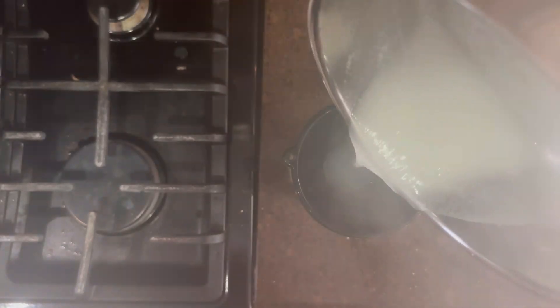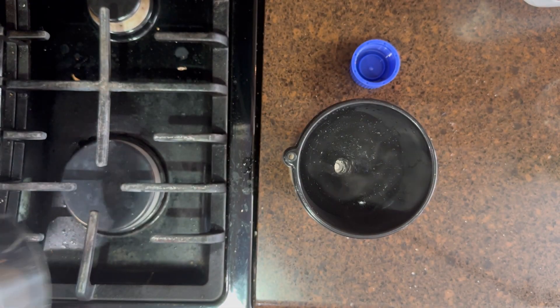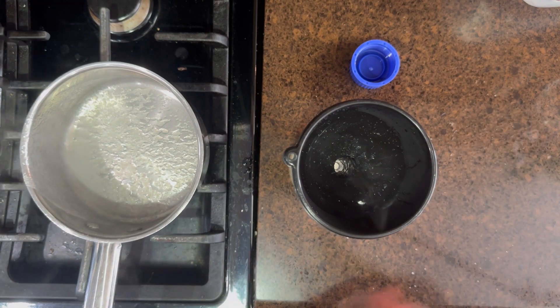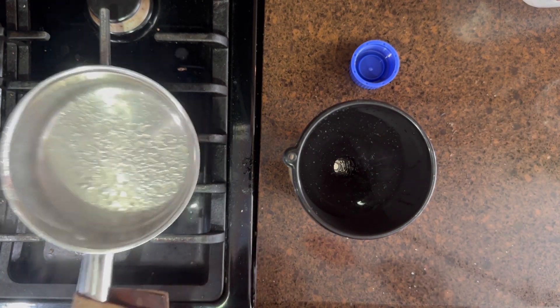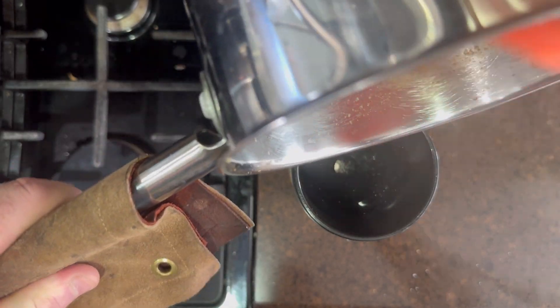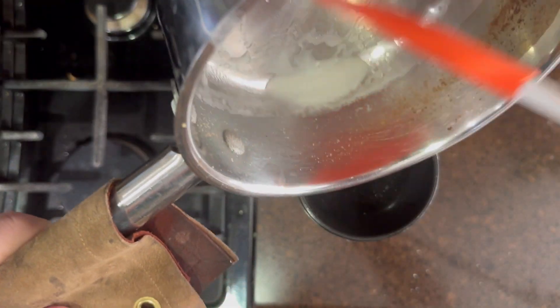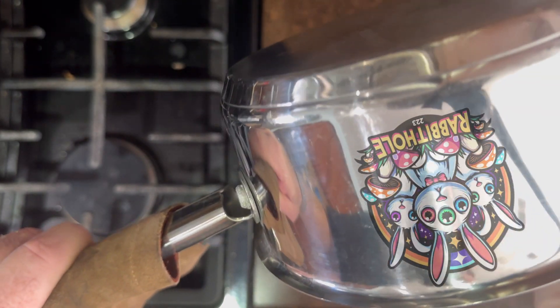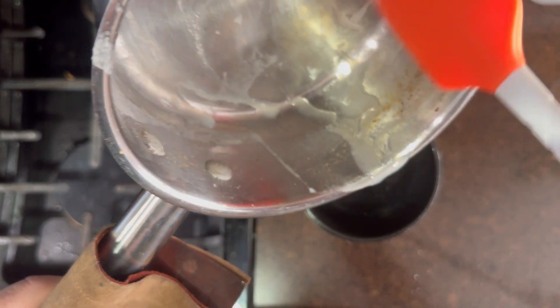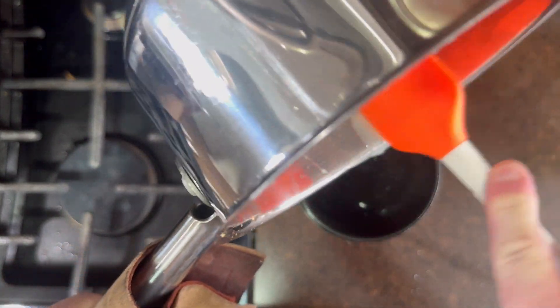Putting the lid on, I scraped this pretty thoroughly. I felt like getting every bit of the substance in there might matter, given that it's going to affect the density of the gelatin and how well it sets — so I wanted to make sure I got every part of the recipe in there.